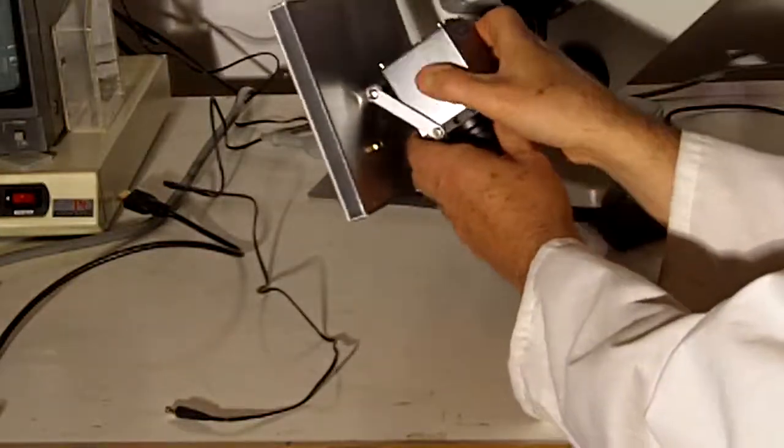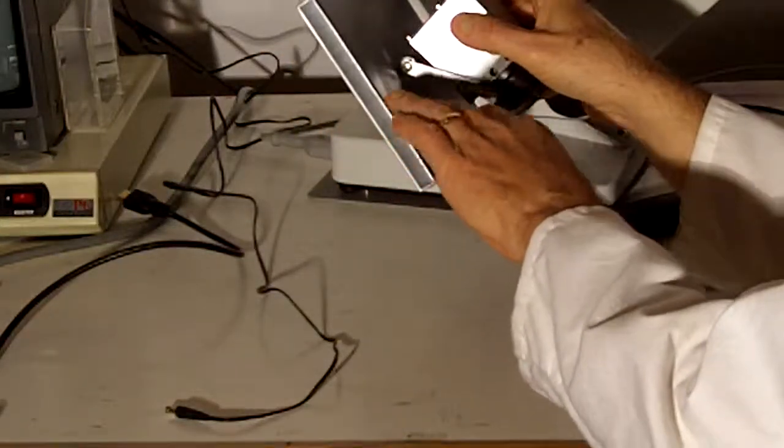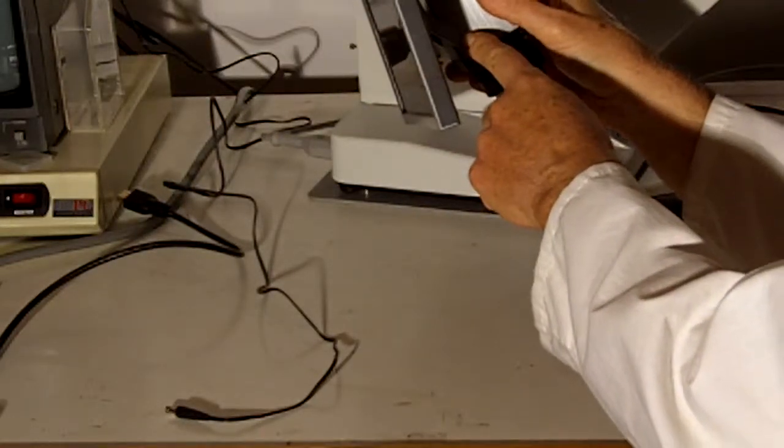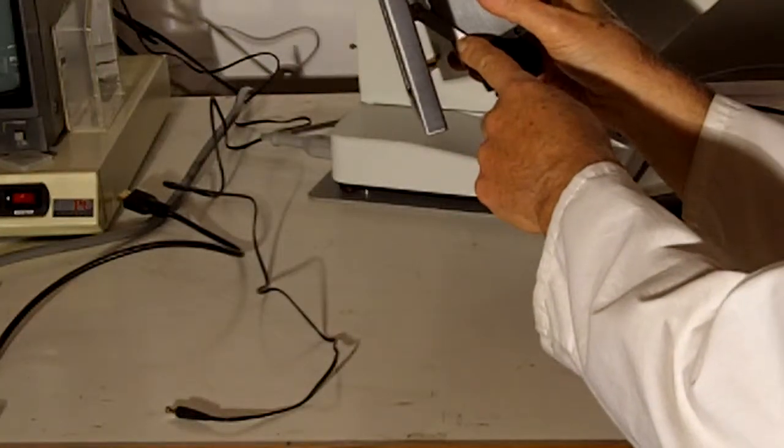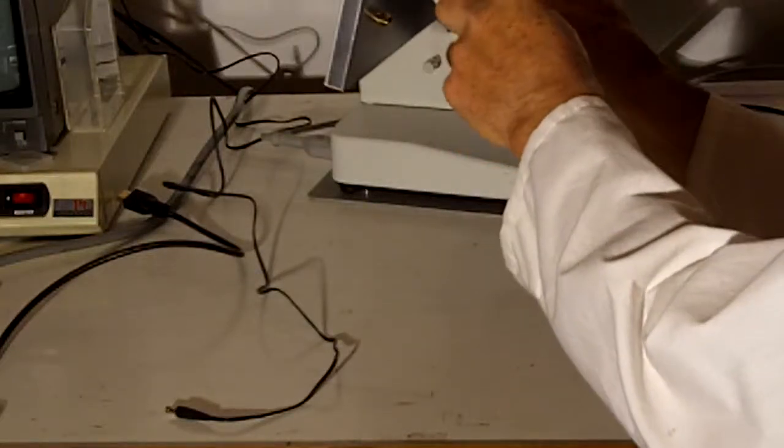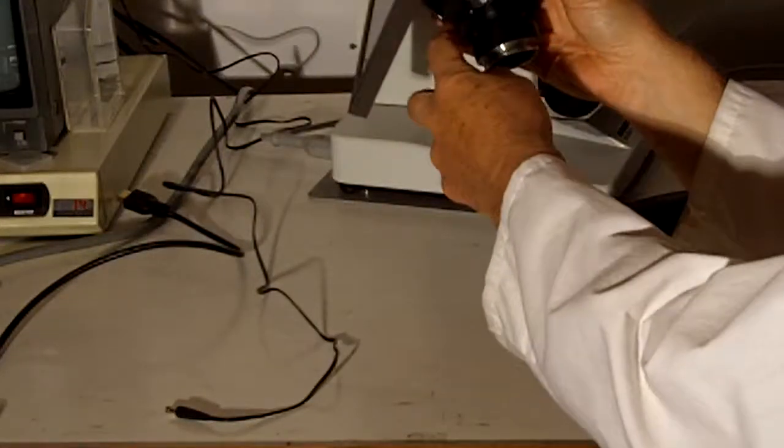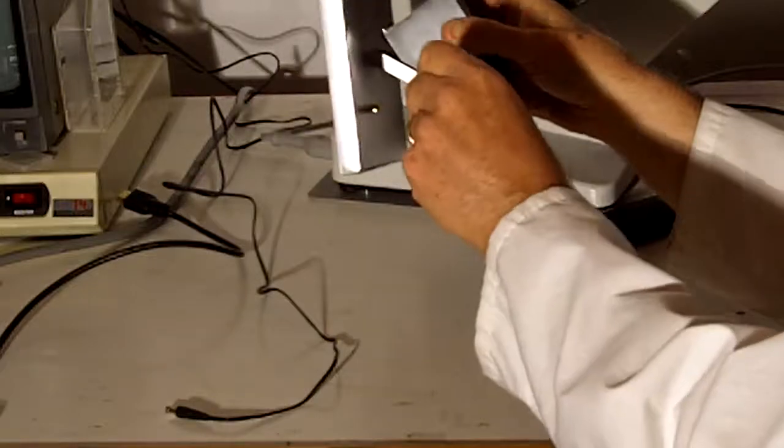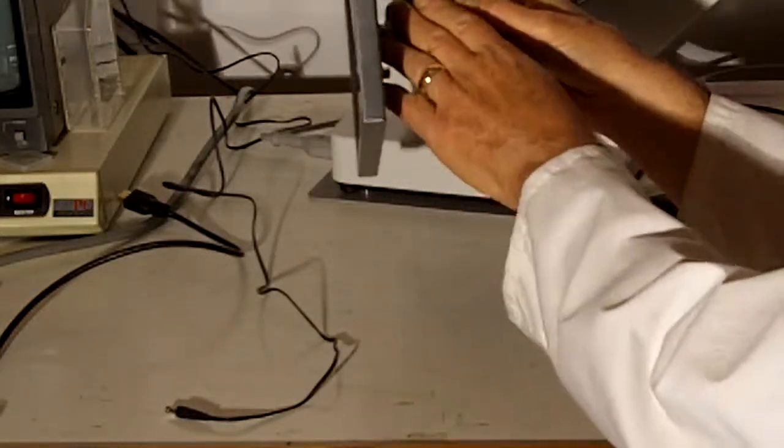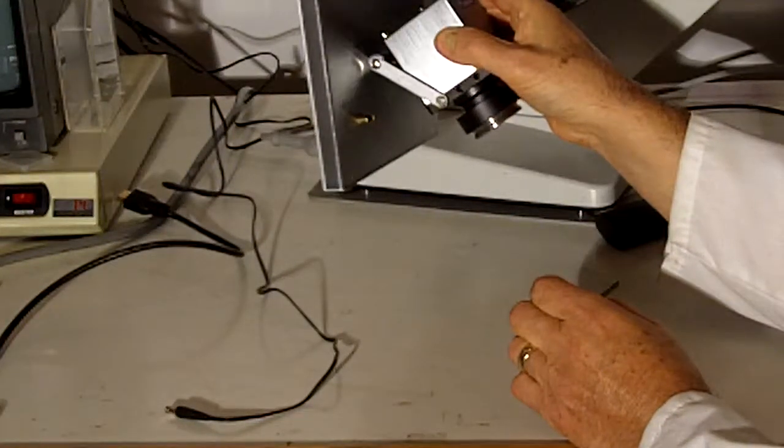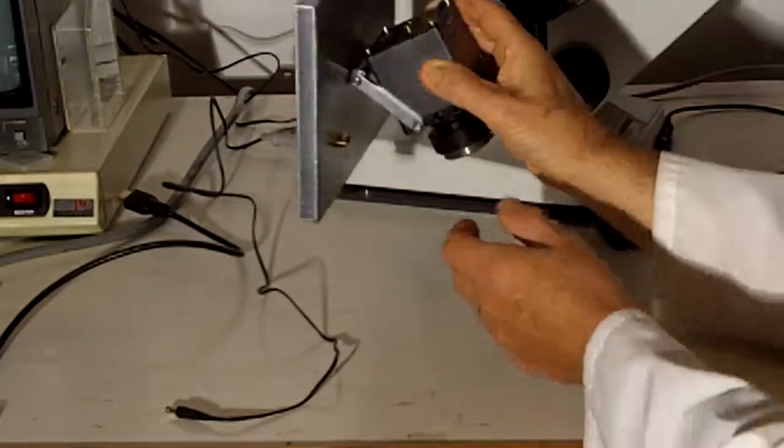The unit is all metal construction with brushed aluminum throughout. The bracket for tilting and adjusting the screen to a comfortable position is metal. The unit is tiltable and adjustable in height. The brushed aluminum housing for the camera and the die-cast aluminum frame with pre-drilled holes are easily connected, providing a good rugged fitting. There's no plastic-to-metal or plastic-to-plastic connection. It's quite a nice unit.